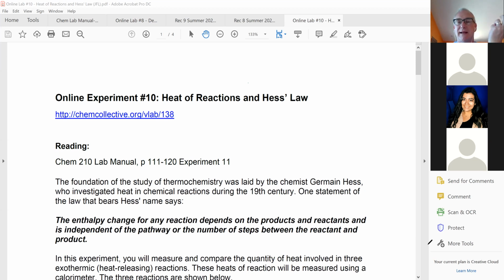One of the things that Hess's law allows us to do is to do two separate reactions, add their energies together, and be able to make a prediction of what a third reaction would be. And basically, that's what we're going to do today.